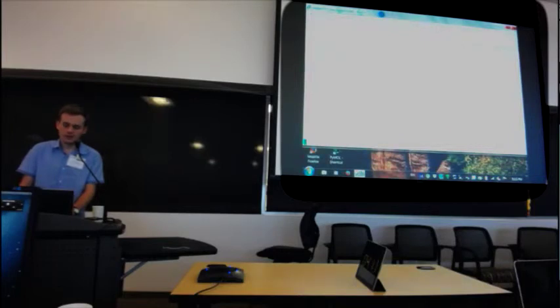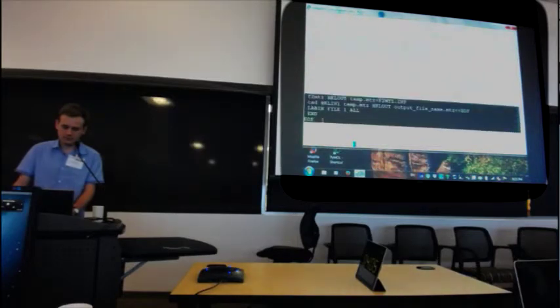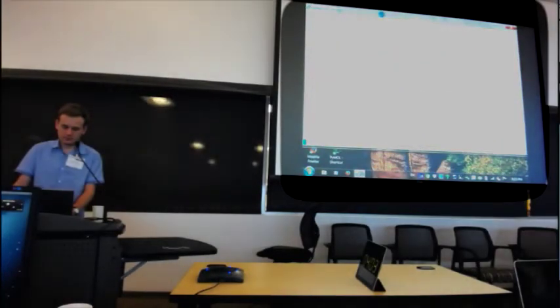Okay. Directly, source and crystal. Do you have it? Yes. Which one? This one. When I go and type it, my sources, right? Yeah. And then, not making it.